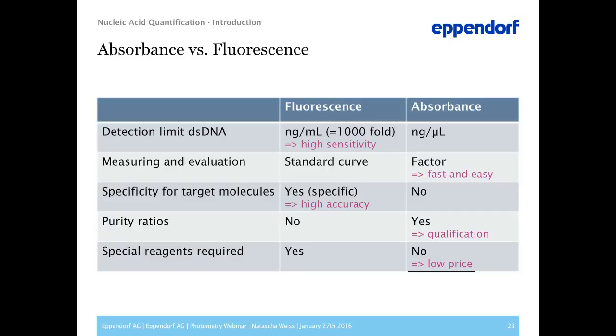For sensitive downstream applications, it may be useful to perform both types of measurements in order to achieve a very accurate quantification in combination with information on the quality of the sample.